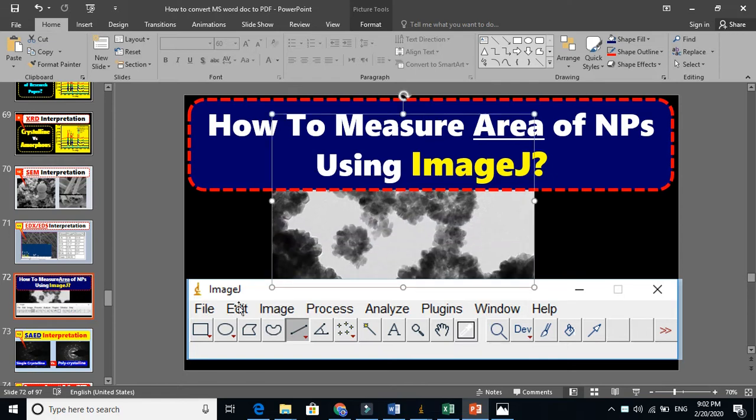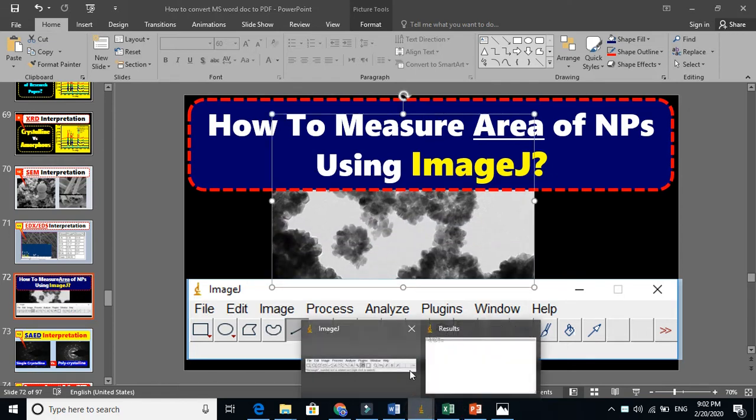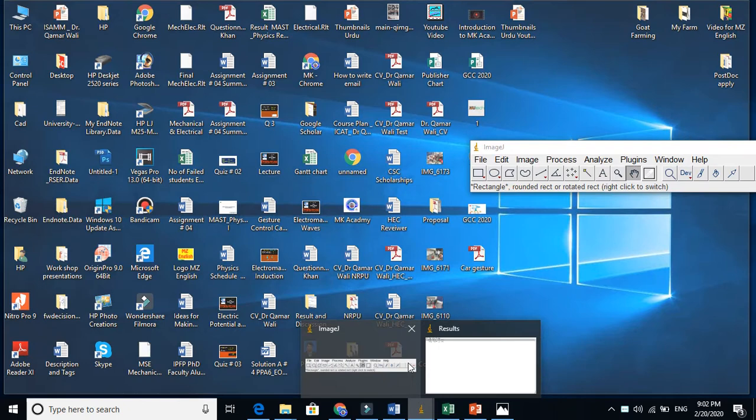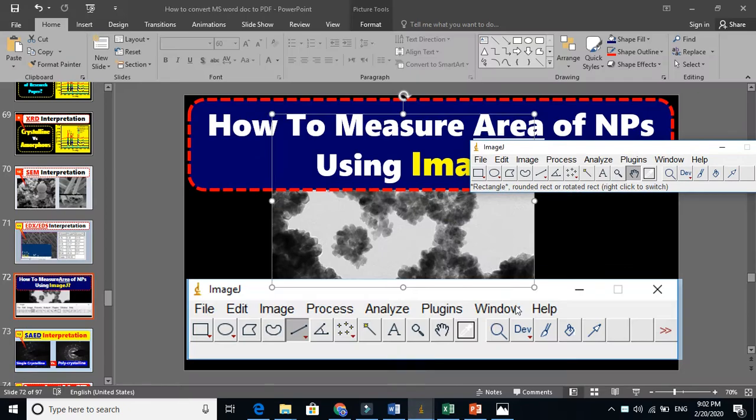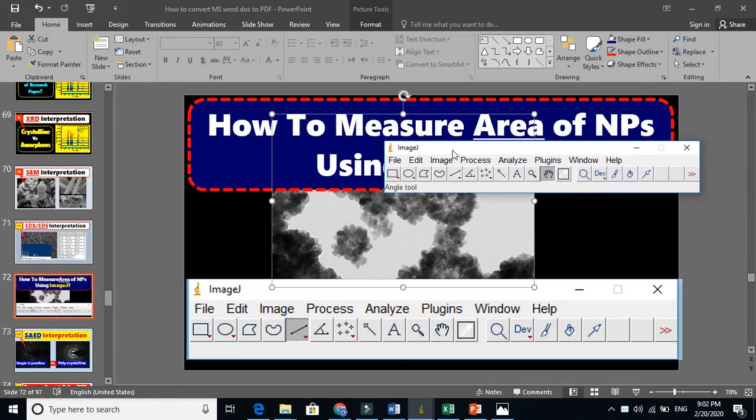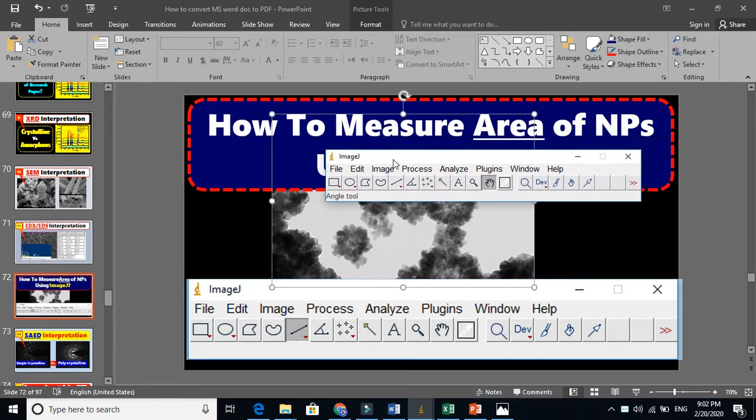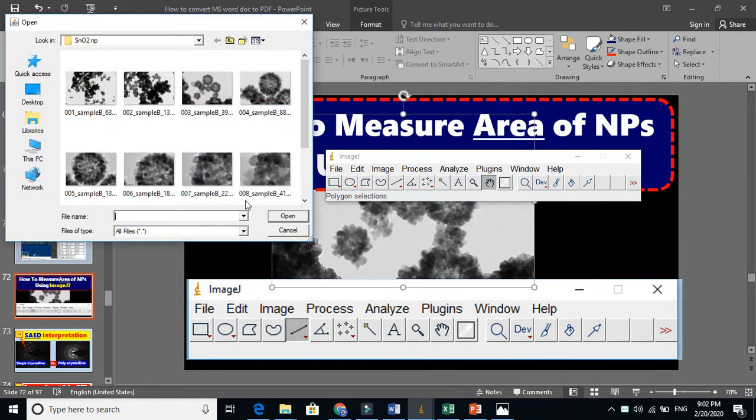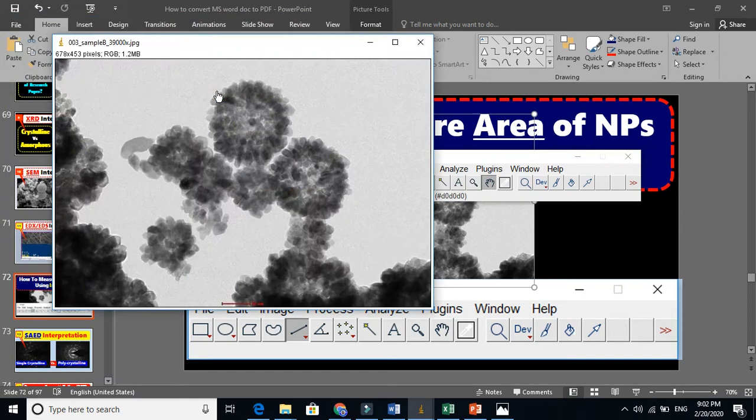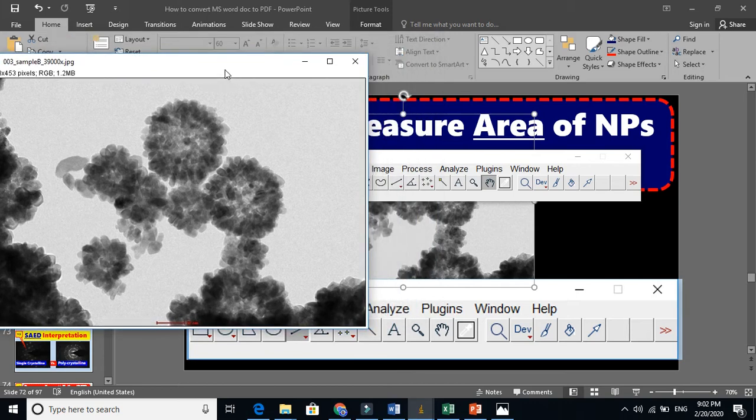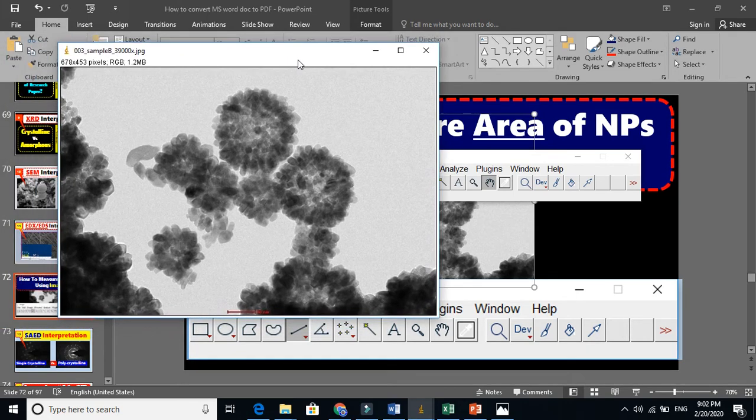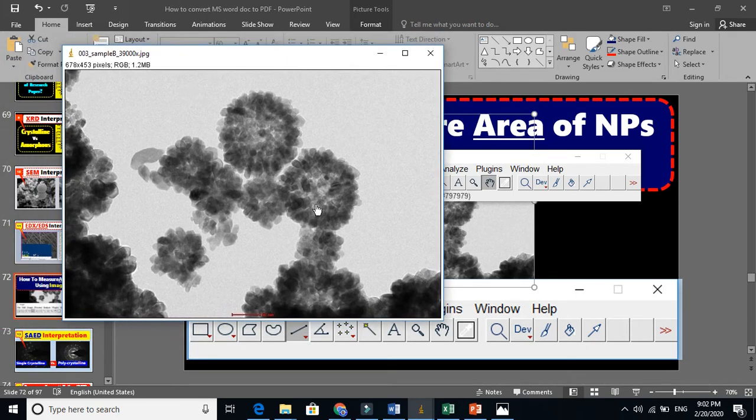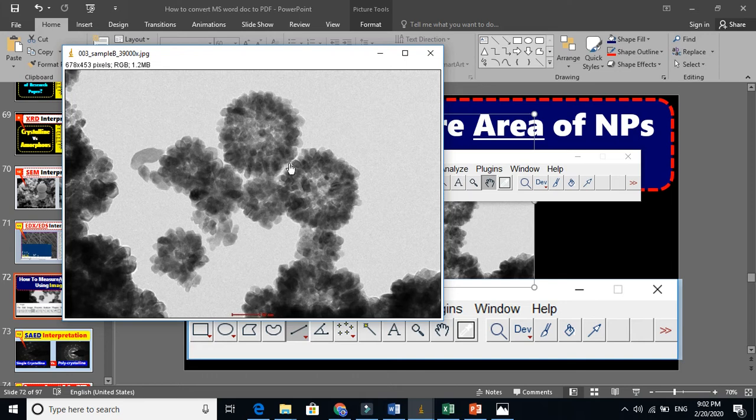This is ImageJ software. Let's see how it works. You need to open your file here. The first and important thing is to tell ImageJ how it will read this, so you need to fit this scale with ImageJ.